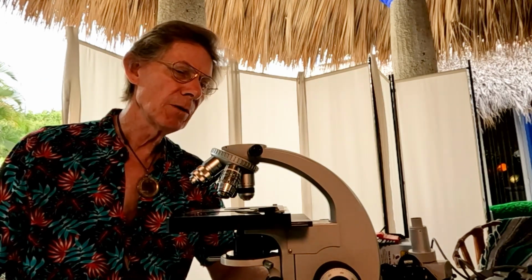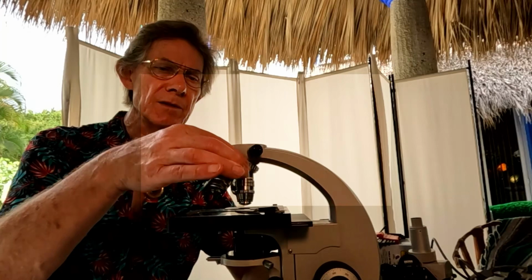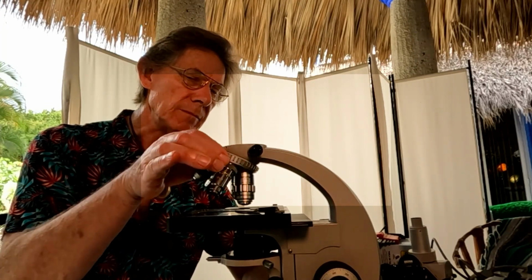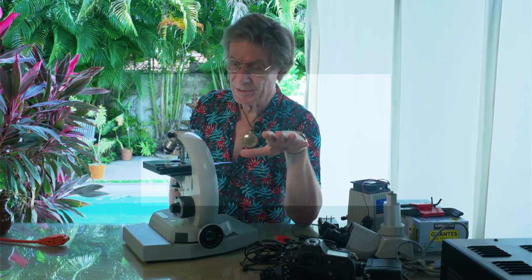Let's go over here. It has a focus component, of course, as would binoculars or anything that acts as a visual aid. It has lenses, which are here, and we can see the lenses. These are the most important part of a microscope in a way. It's all important, but the quality of the lenses is something that must be talked about here. There are low quality, low resolution lenses, and there are medium quality, and then there are the incredibly high quality lenses, which is what I use.